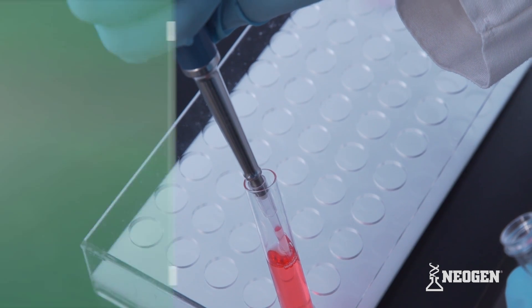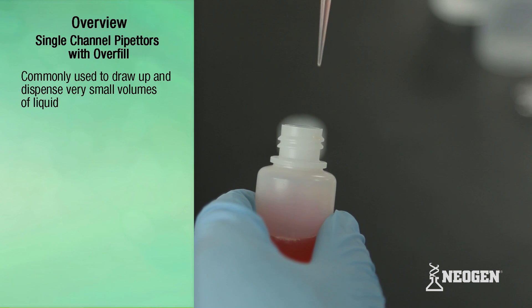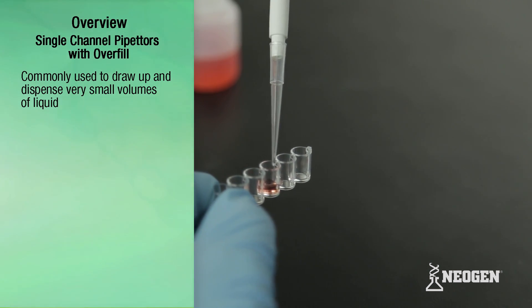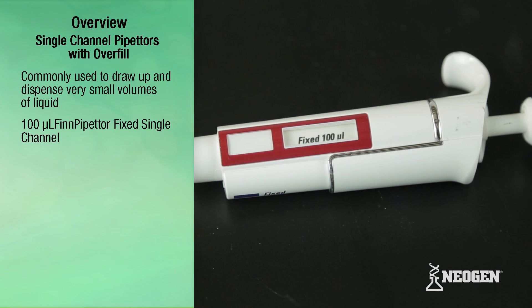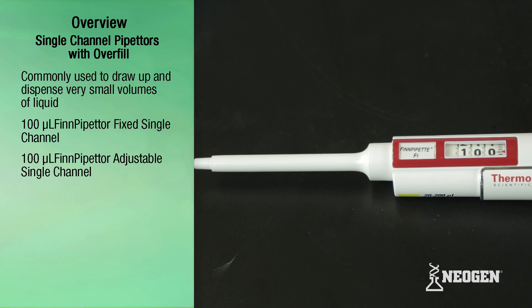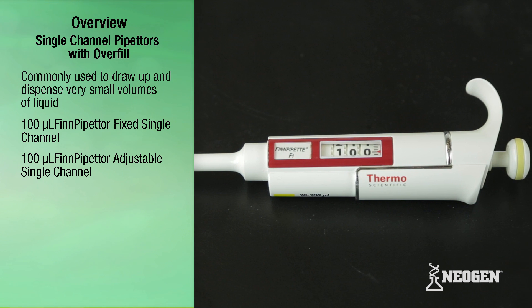Pipetters are instruments commonly used with Neogen kits to draw up and dispense very small volumes of liquid. The most common pipetters used are the 100 microliter fixed single channel pipetter and the adjustable single channel pipetter. Note that others are needed at times.